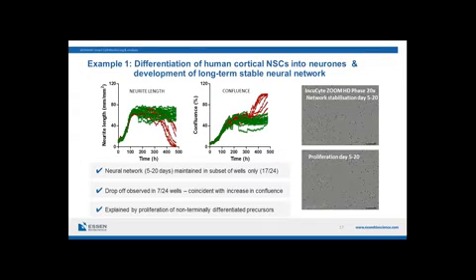When we reviewed and looked at those images and reanalyzed them for confluence as well as neurite length, it was very clear that there was a strong correlation between the drop-off in neurites and this increase in cell confluence. And it didn't take us long, by retrospective analysis of the images, to verify that the reason why in the subset of these wells we saw this unstable neurite network was because the non-terminally differentiated precursors, which were relatively few and far between, had begun to proliferate and dominate the culture. So throughout the course of the assay, we had the ability to understand what was going on.